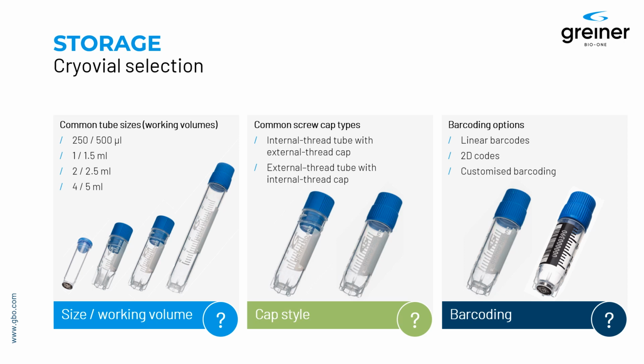Then intermediate volumes ranging from 1 to 1.5 or 2 to 2.5 milliliters, and larger volumes in the range of 4 to 5 milliliter. There's also larger devices or containers available, but keep in mind that the larger your container is, the more you have difficulties with controlling freezing rates and finally achieve freezing rates that are good for your process and your sample.